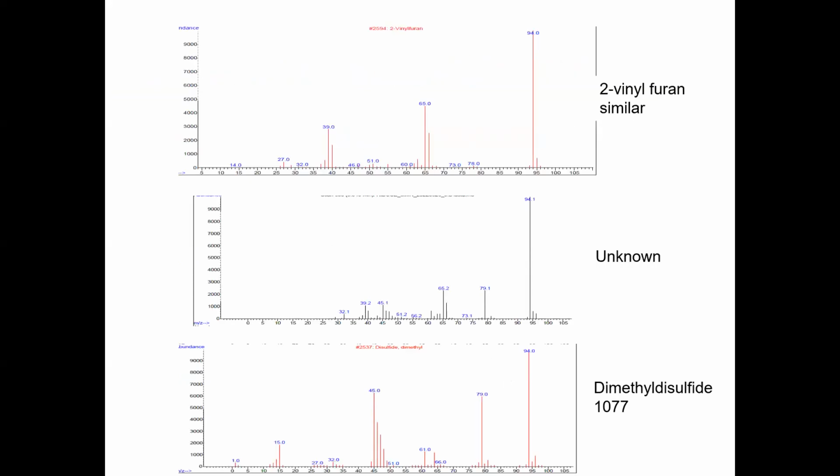So this again comes from Christy Standard. She's saying, I wasn't sure about this particular compound. She got this in her analytical run. This compound fragmented into a piece that had a mass of 32. Another piece of that molecule had a mass of 39, 45, 51, 56, and so on. And so that is a typical mass spectrum of the pieces it was blown into within the mass spectrometer.